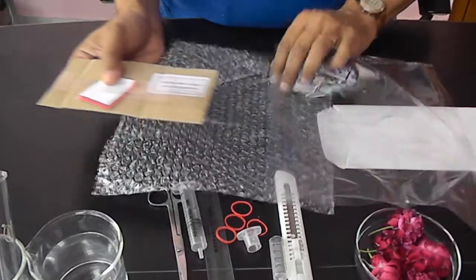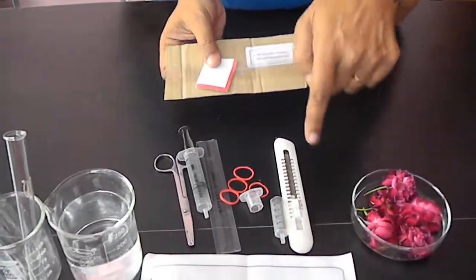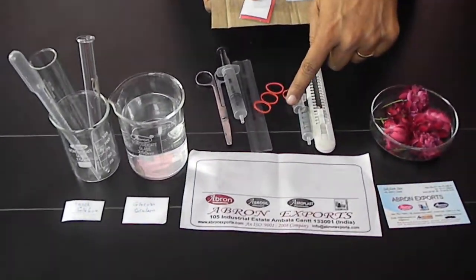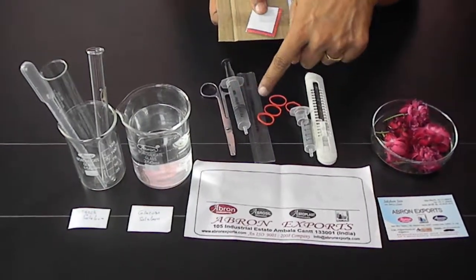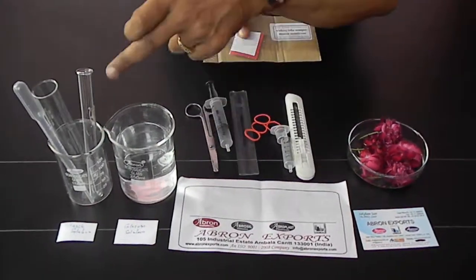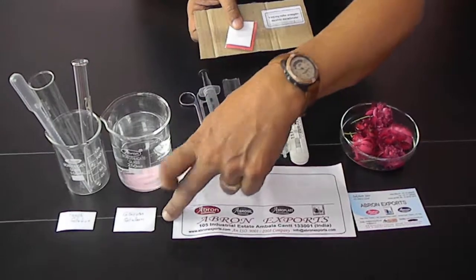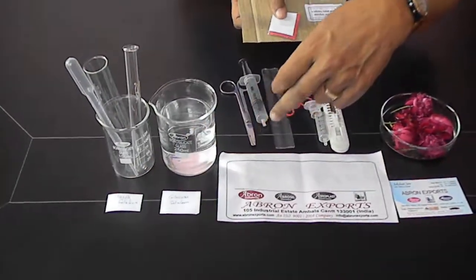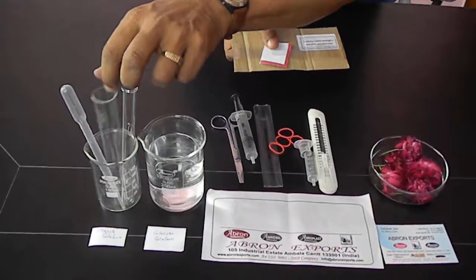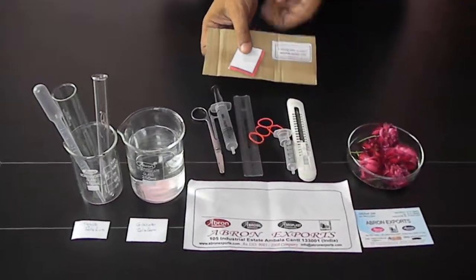What you need are simple things to perform the experiment: one cutter, two syringes, one scale, and two solutions - glucose solution and starch solution - and one big test tube and dropper. These are the things you need for the experiment.